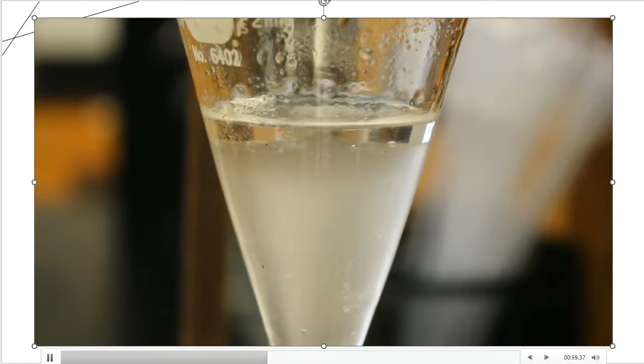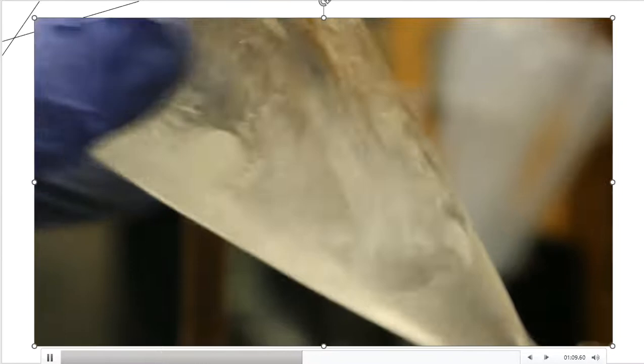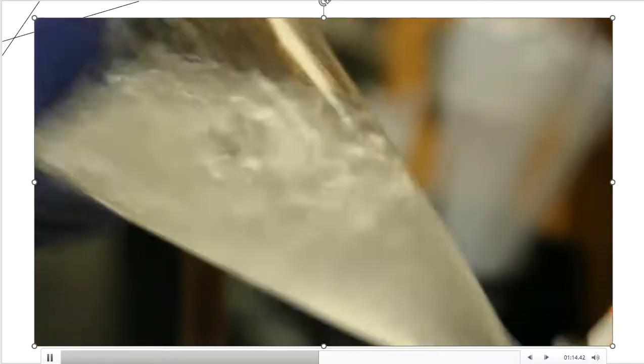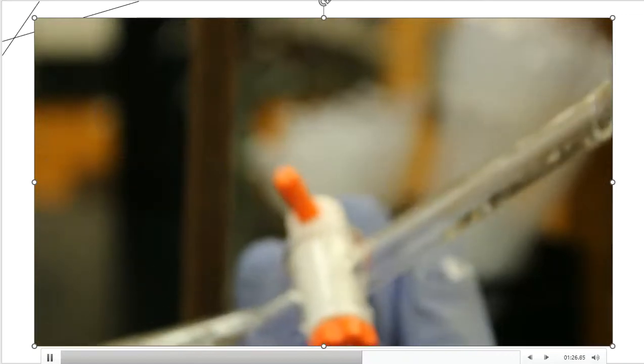Now, I can't just do this and call it a day, right? I'm going to have to put the lid back onto the separatory funnel, and I'm going to have to get these two layers to actually swish back and forth. So I give the separatory funnel a nice shake like I'm a bartender behind the bar, and then I'll point it up, and I'll open up the stopcock. And when I do, you heard that hiss. And then I'm going to close that back, and then I'll raise this up and I'll give it another shake.